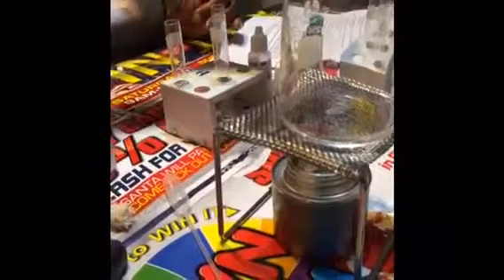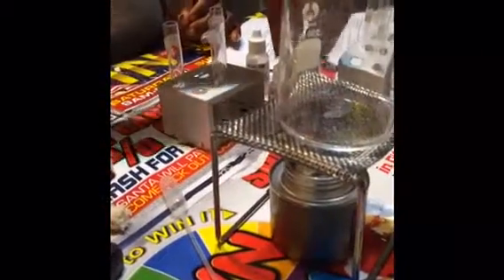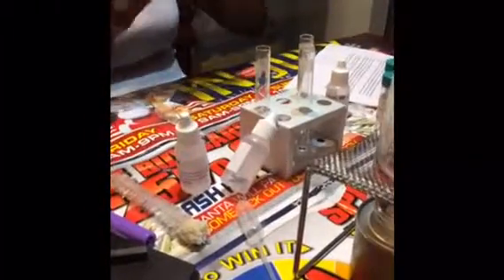Next is methanol. 5 drops of methanol into test tube 1. Next is 5 drops of ethanol into test tube number 2.